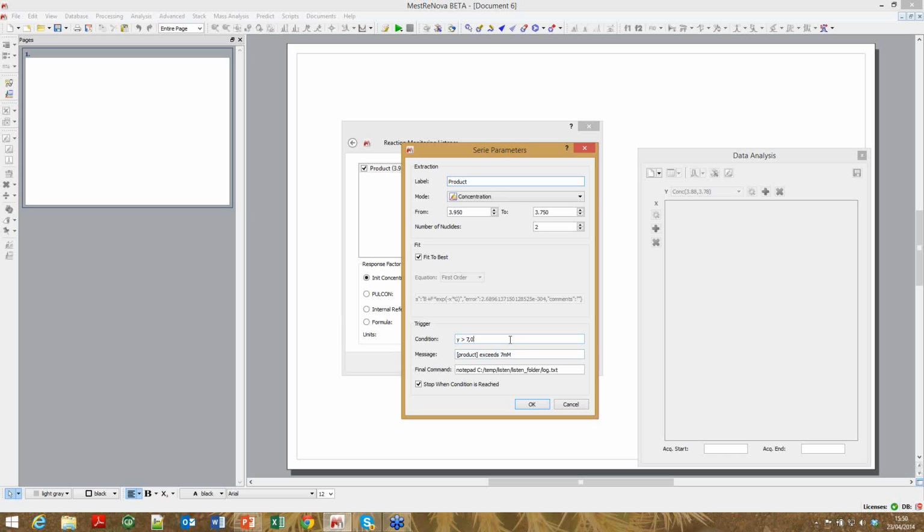And there's two things I can have it do. One is to give me a message on the screen. That's that over there, which you'll see. And I've asked it also here to basically just show the log file in Notepad on the screen, just as a simple example. But what it's doing here is to fire off a command line.